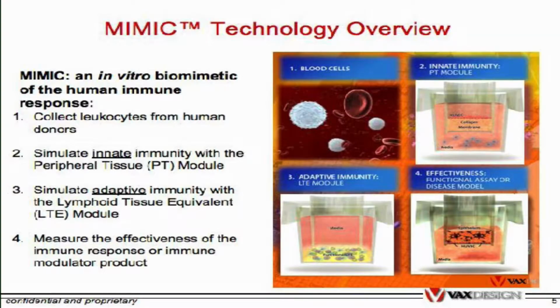How do we get our cells for constructing our immunological modules? We have a system whereby we leukophorese donors. We have solicited numbers of donors. We pay them handsomely. They come in. They go to the local blood bank.